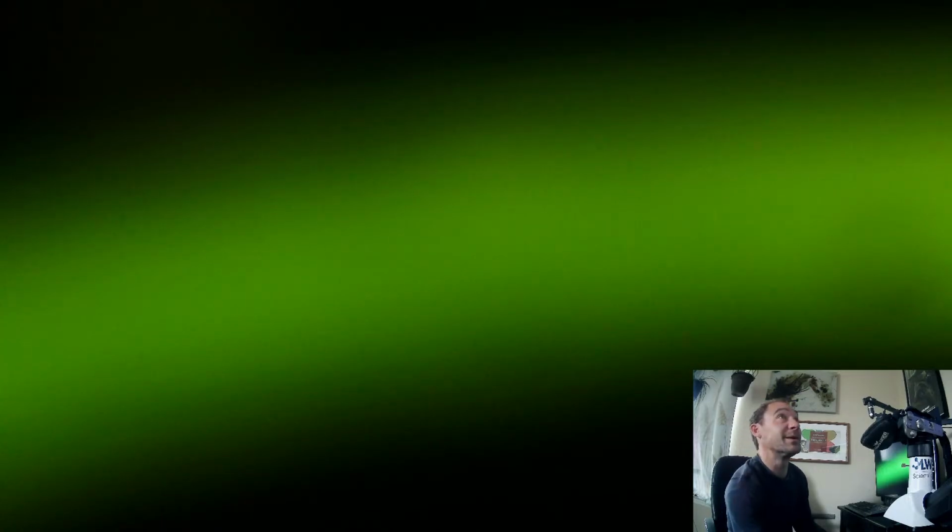Alright. Yep. Oh no, this isn't quite to the end. Wow. This is glowing really bright. Let's see, is this the younger or the... Oh no, yep, this whole part over here to the left all got pinched, because I was rushing when I was setting up for the stream because I was a little bit late.